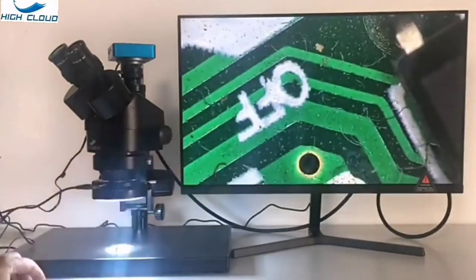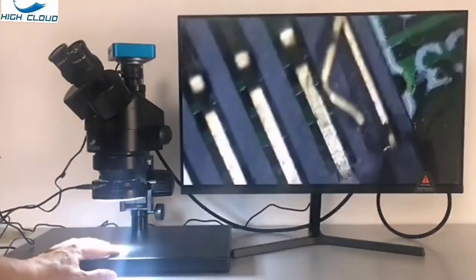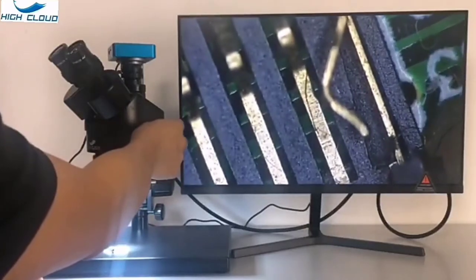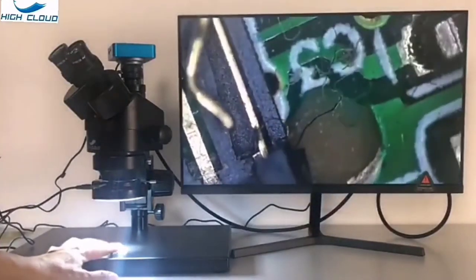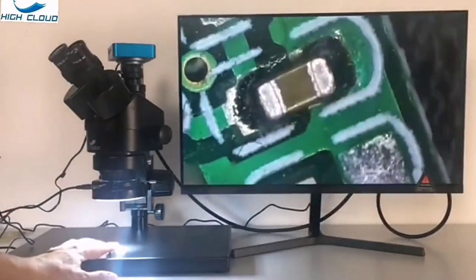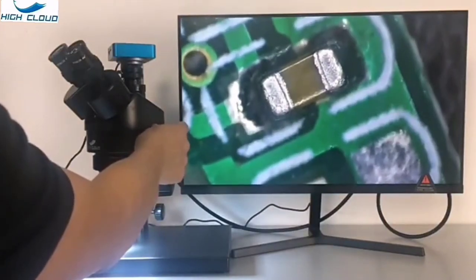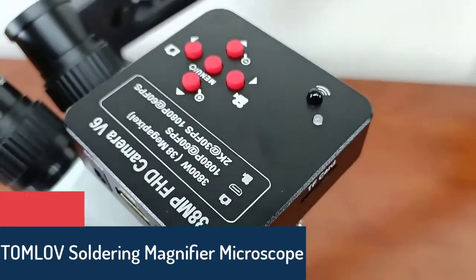Specifications: Head 45-degree inclined, 360-degree swiveling trinocular simul-focal. Eyepiece 30mm super wide field high eye point WF10X/20. Objective 0.7–4.5 zoom range. Trinocular port 23mm photo port. Interpupillary distance 54–76mm. Field of view 21.4–33mm. Working distance at 7x–45x: 100mm using 0.5x objective.